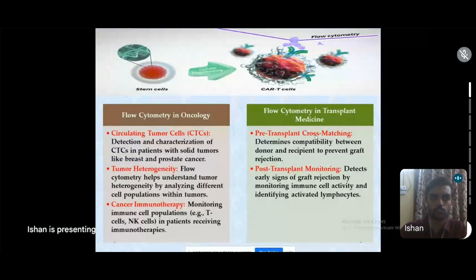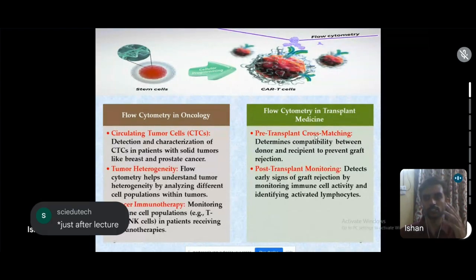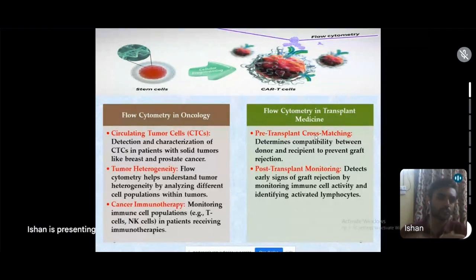And when we take a biopsy or a tissue from a tumor, both are invasive procedures. So what is the non-invasive process? We are not saying it is fully non-invasive, but it is less invasive. We get a blood sample and we can see whether these tumor cells are circulating inside our body, whether in the lymph or in the blood.